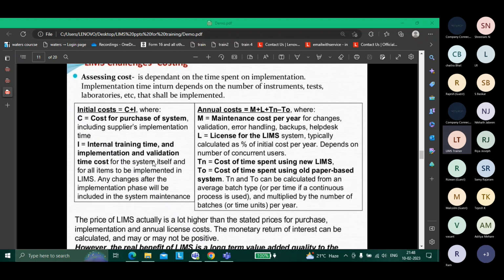That's why you have heard about migration projects, where you migrate from one kind of LIMS to another, because maybe one pharma company is using 2 to 3 different kinds of LIMS. They suddenly decide they will now work in only one kind of LIMS, to discard all ambiguities. So they try to migrate all kinds of LIMS to one. Doing that also takes time. You decide which LIMS you want to work on, take all the licenses for it, and after migration is done, train all your analysts in it, and going ahead they'll work on this.